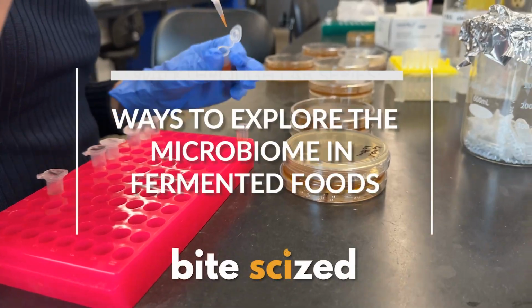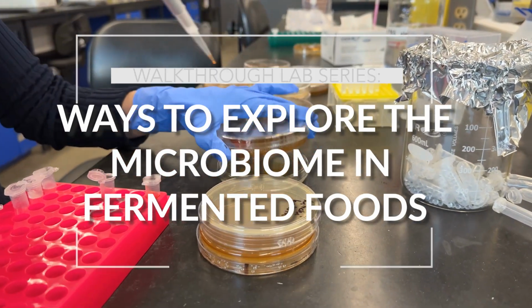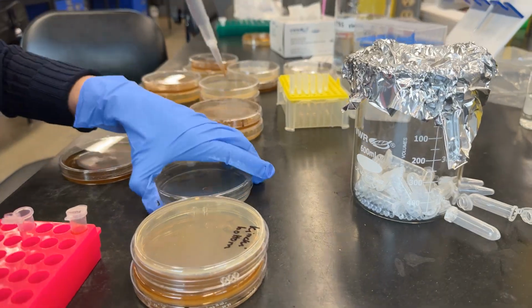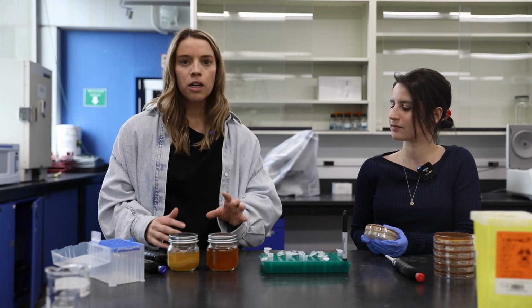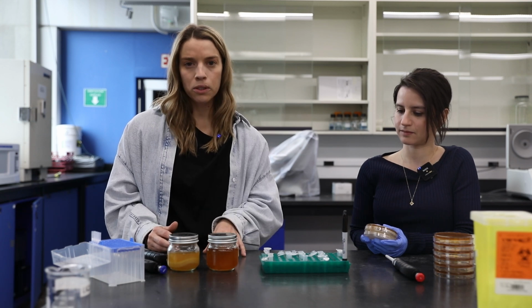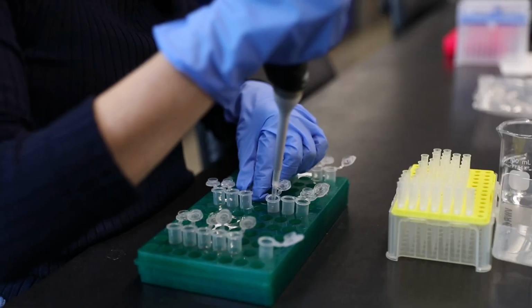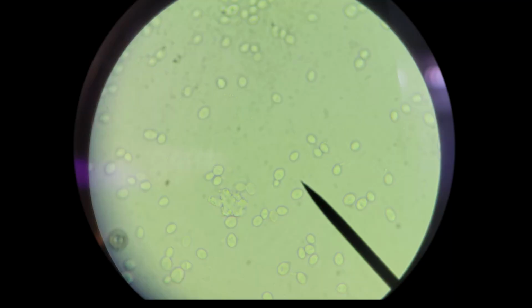Today we're going to be exploring different methods and ways that you can further explore what microbes are in fermented foods and drinks. Today we'll be exploring kombucha. Okay, so at this point you might have made a fermented food, seen some evidence of what's going on, but we still don't really have that much information about what microbes might be present in these samples. So today we're going to walk through a series of videos that help explain different methods and techniques that you can use to further understand what might be in here.